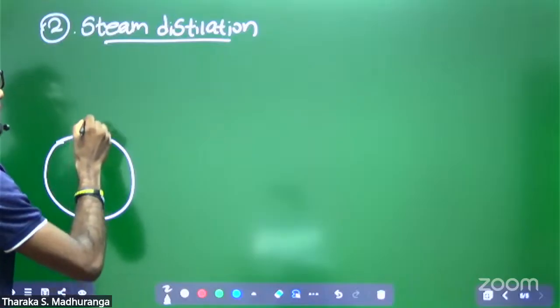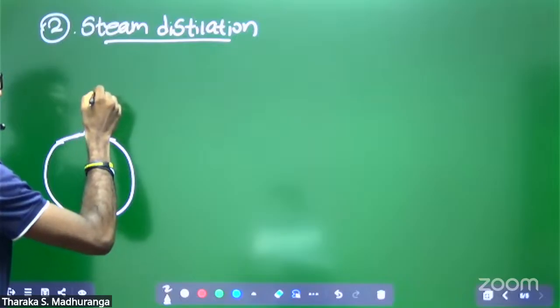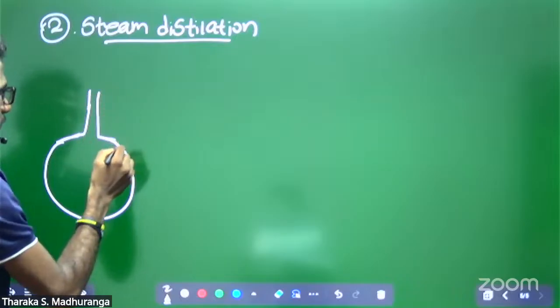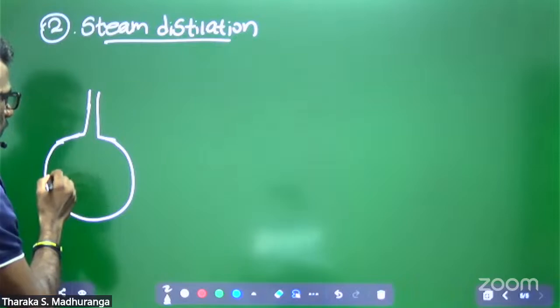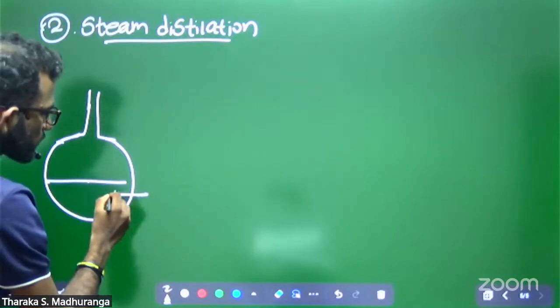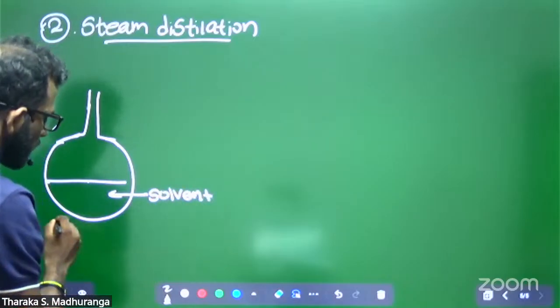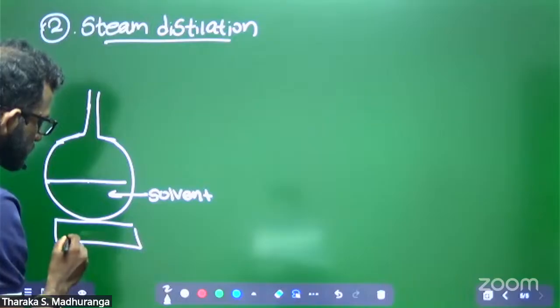That's a round bottom flask, and this is the solvent, and this is the heater.